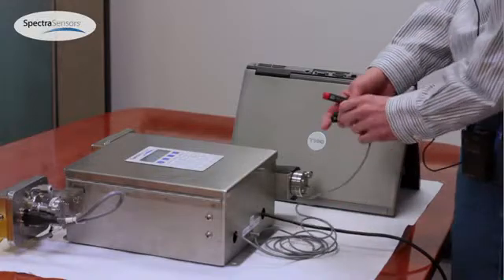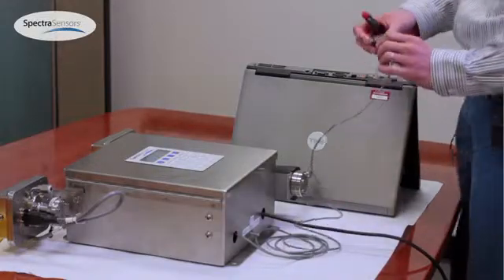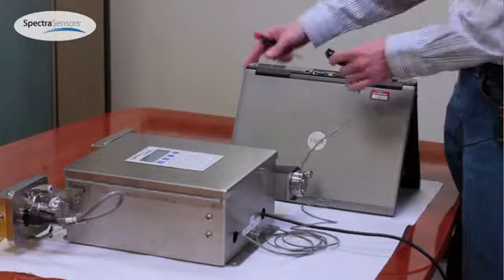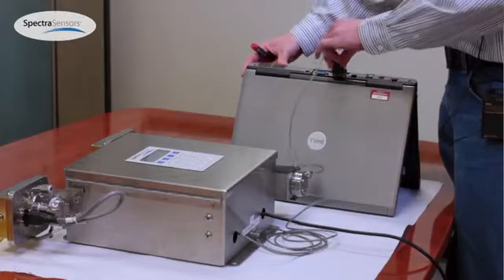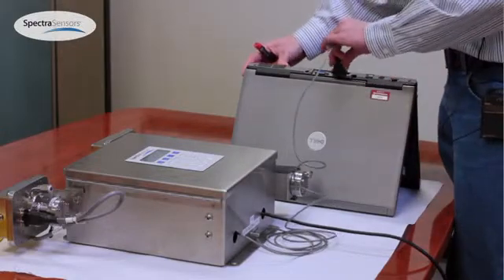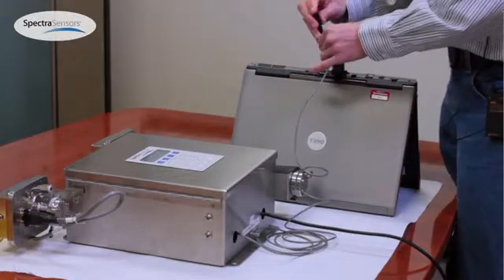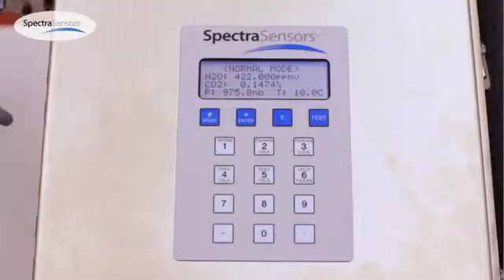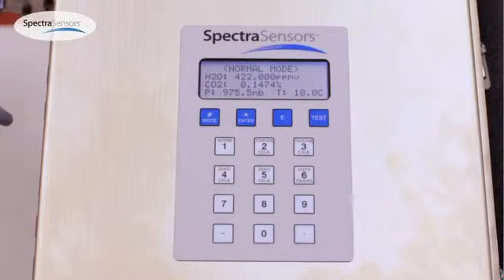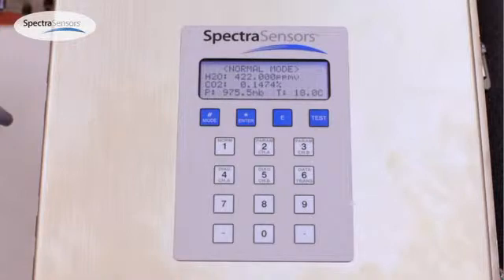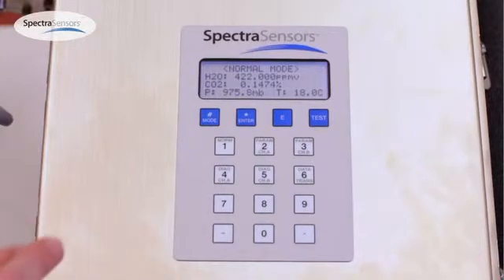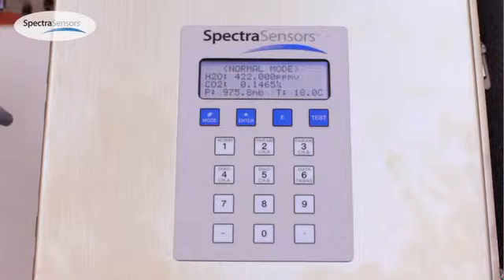Once the connections are made to the analyzer, connect the other end to your PC, and secure the connection. For an SS3000, to do a data dump for the channel A, remember to connect and use the connection that's made for the same as an SS2000, the channel A serial position.